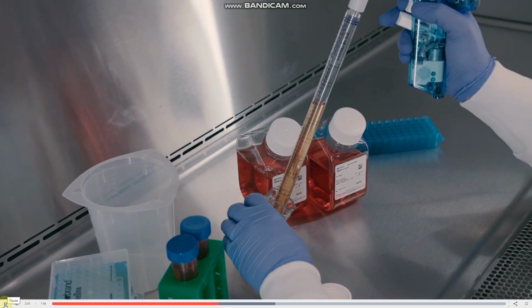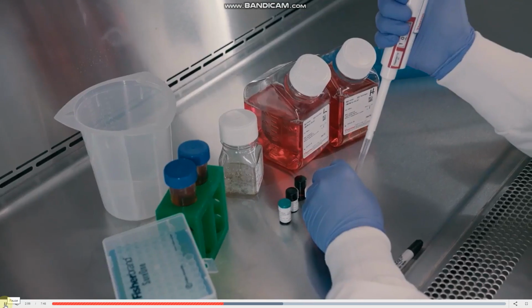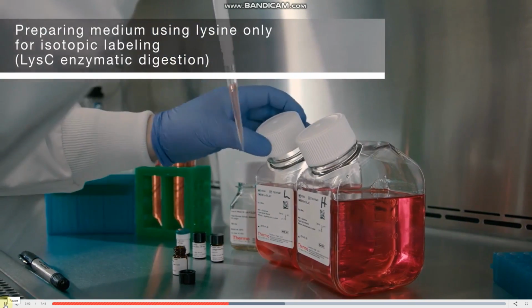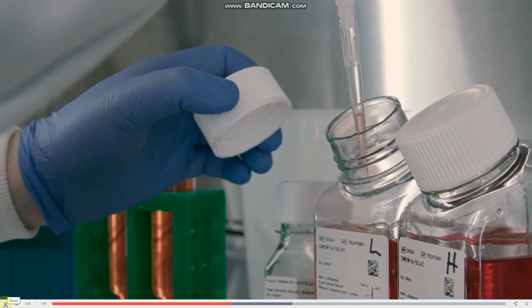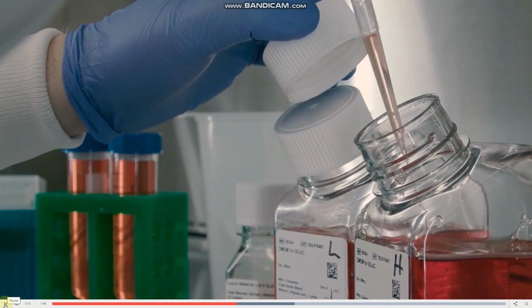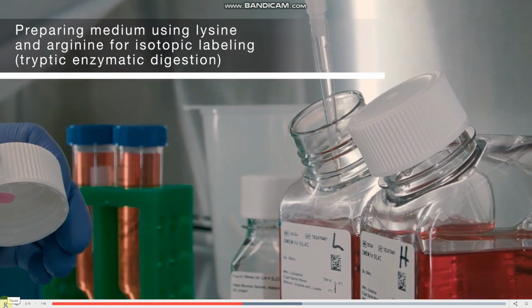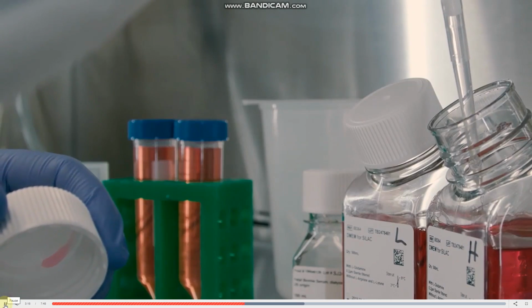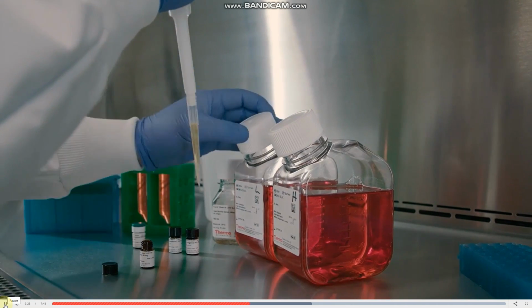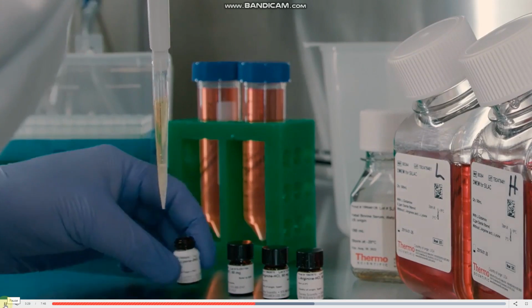As SILAC medium is deficient in both arginine and lysine, both amino acids must be added to the medium to support cell growth. For experiments using only lysine for isotopic labeling and subsequent enzymatic digestion, supplement each bottle by adding 50 milligrams of the dissolved light arginine. Next, add 50 milligrams of dissolved light lysine to one bottle and 50 milligrams of dissolved heavy lysine to the other. For experiments using both lysine and arginine for isotopic labeling and subsequent tryptic enzymatic digestion, add the light lysine and arginine to one bottle and the heavy lysine and arginine to the other.